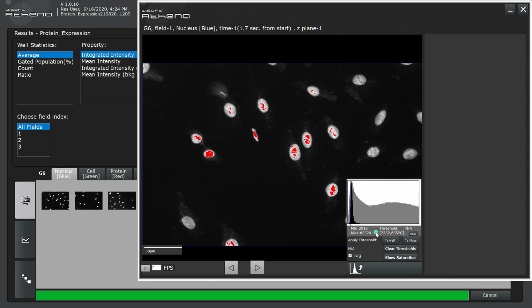When adjusting the contrast range for visibility, we define intensity values for coloring pixels either black or white in the rendered grayscale image. Black colored pixels are equal or less than the lower bound, while white pixels are equal or larger than the upper bound. Again, this is only a visualization and does not change the raw image data. Within the pixel intensity histogram, we click and drag to define the range of pixel values to be displayed.